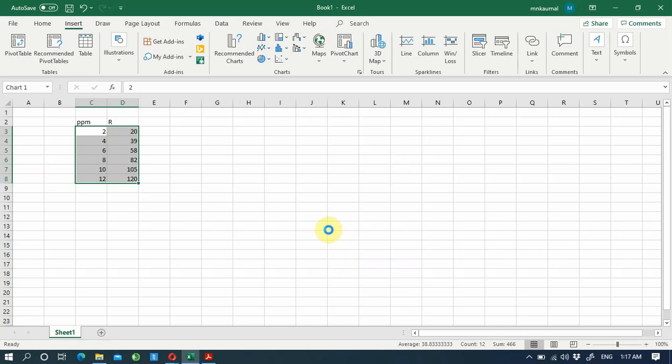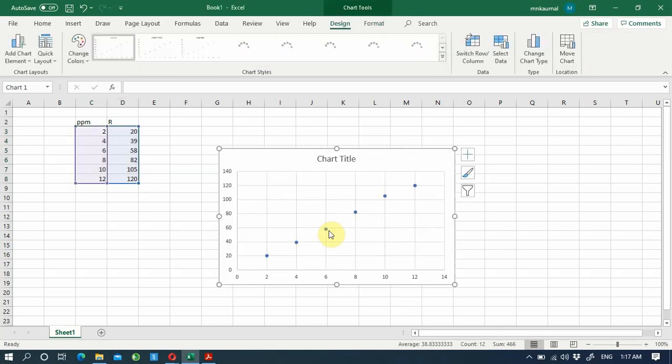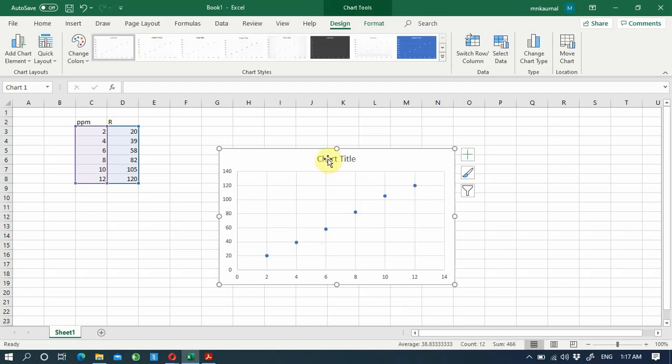I have seen many students make mistakes when drawing a calibration graph. The first mistake is leaving the title on the chart itself. For a figure in scientific writing, the title or figure caption should go below the figure and be included separately.